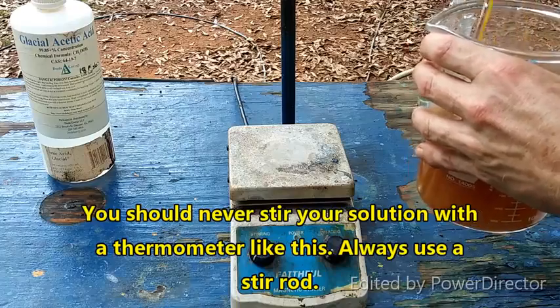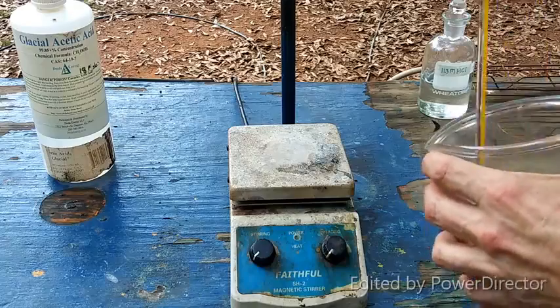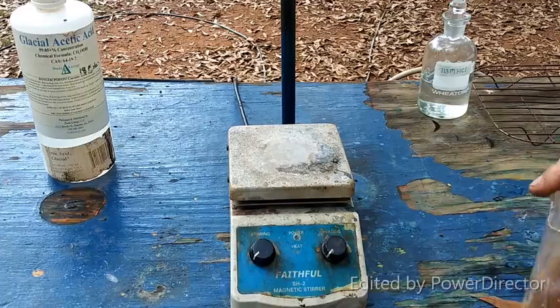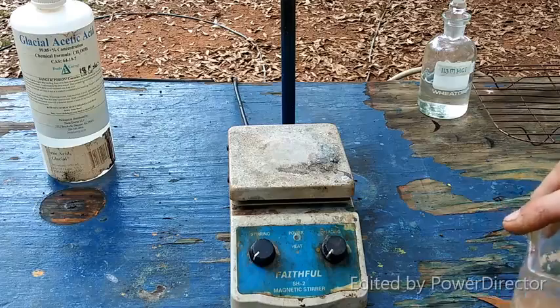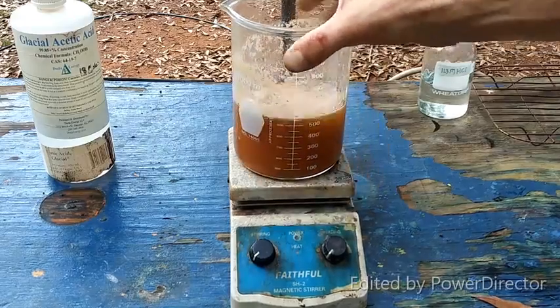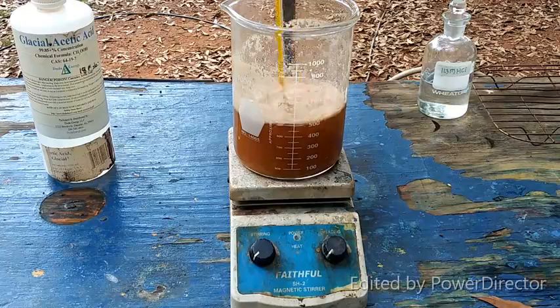I know, you should never ever stir stuff up with a thermometer. Every chemistry teacher will tell you that's terrible and awful, and they're absolutely right, it really is. You should not do that, because if the thermometer breaks, it's going to ruin everything. But then again, you're not doing this at home, so I'm just telling you for general chemistry lab knowledge.